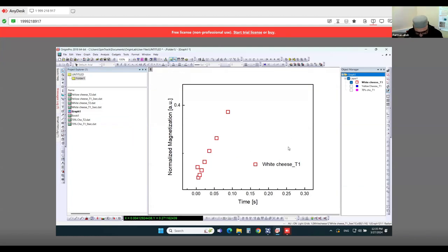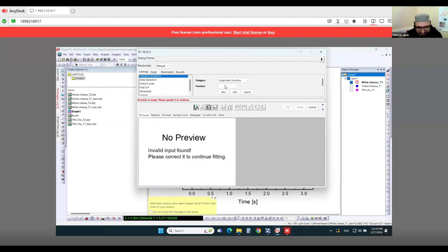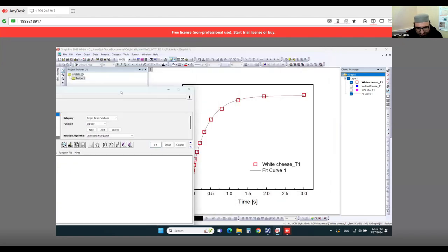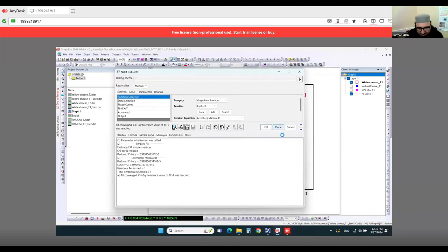I was surprised what was happening. I was surprised that both colors are the same, so this one. Yeah, so let's see again what happened to our function. We have to go directly here. It seems done.